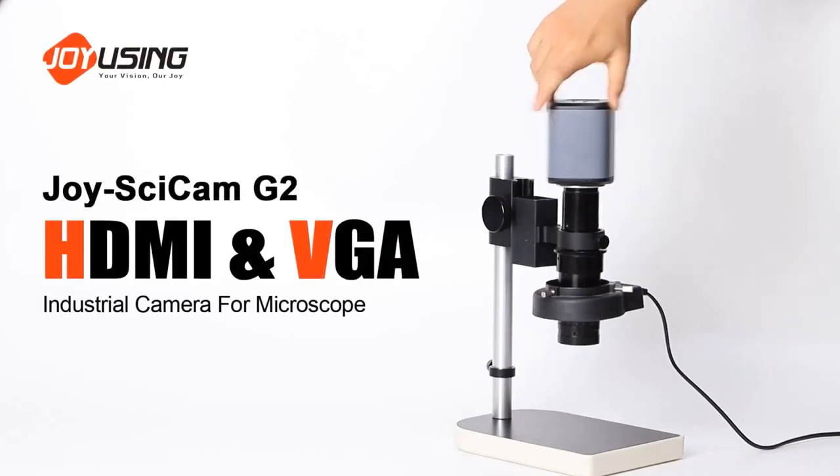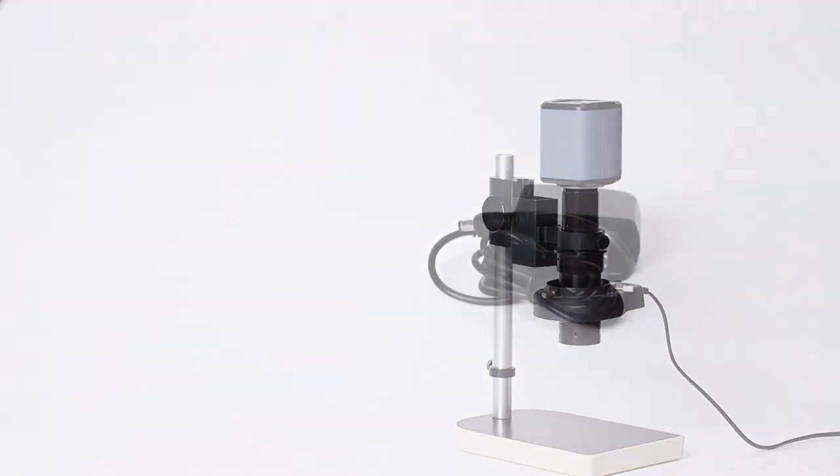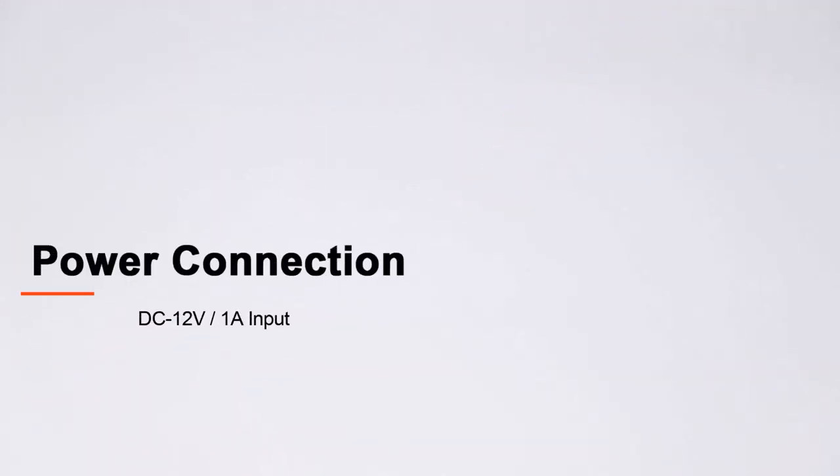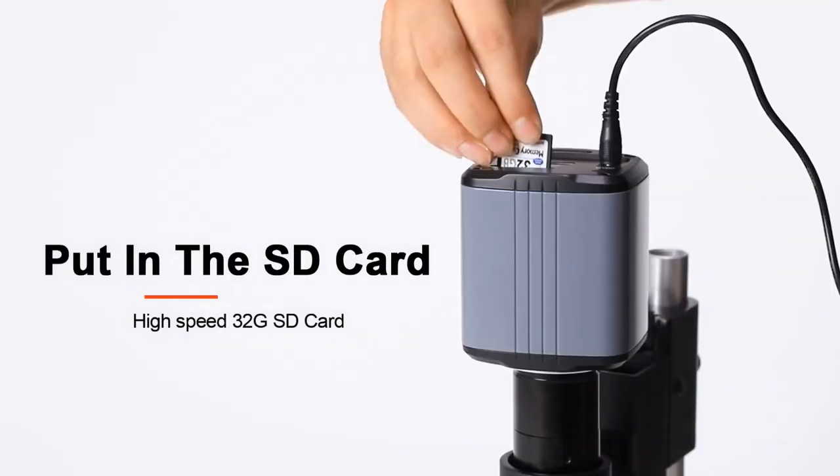Put the industrial camera onto the microscope and screw it tight. Then connect it to the power supply with the adapter and insert the high-speed SD card.